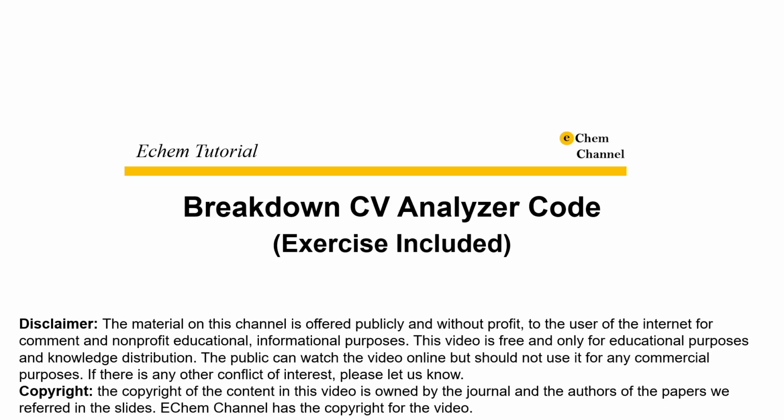I will briefly review the CV Analyzer program and the calculations, overview the outline of the code, break down the CV Analyzer program line by line with demos of functions, and end with a recording of my attempt at writing a new feature of calculating energy density and power density as an exercise. With the exercise, I hope to demonstrate a few troubleshooting methods as well. I will try to explain MATLAB basics along the way, but some background knowledge is probably needed.